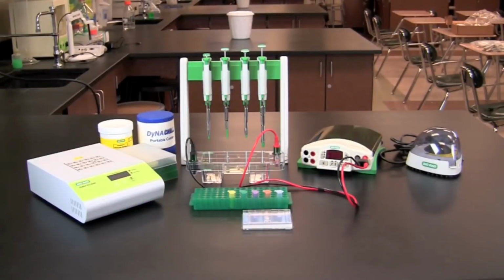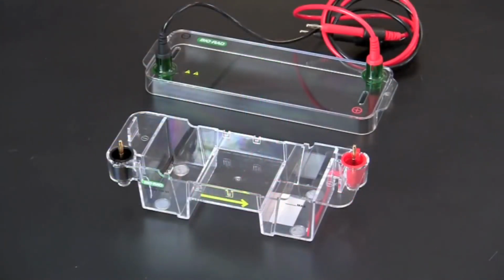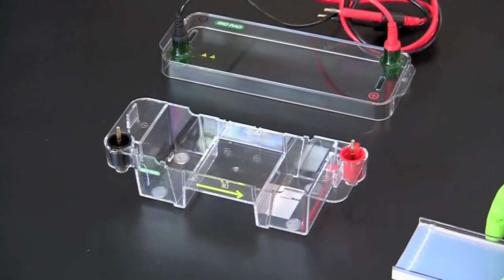In this video, we will learn how to load and run DNA samples on an agarose gel. We will be using a mini subcell to perform our agarose gel electrophoresis. The subcell has an electrode wire running across the bottom of each end. This allows the electrical current to pass through and separate the DNA fragments based on weight. The first step is to align the gel so that the wells are closest to the negative side. DNA is negatively charged, and as the electricity passes through, DNA will move towards the positive or red side.